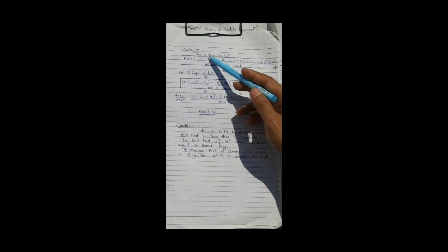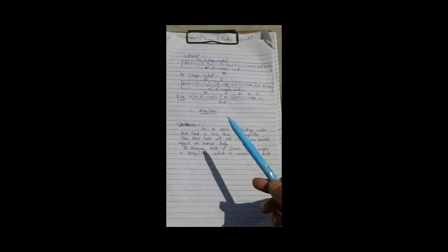This is the formula for the 5 days of incubation, or this is for the 3 days of incubation. After the calculation for the given sample and the blank, the answer is 8 milligram per liter.